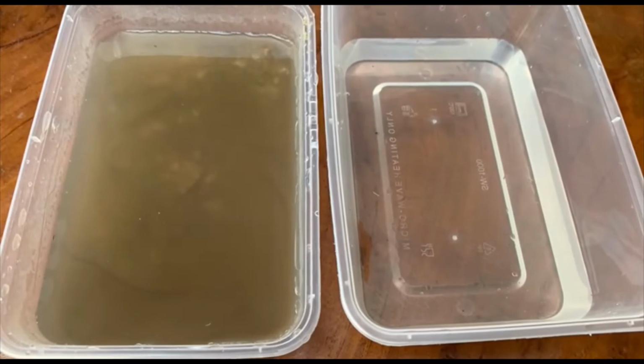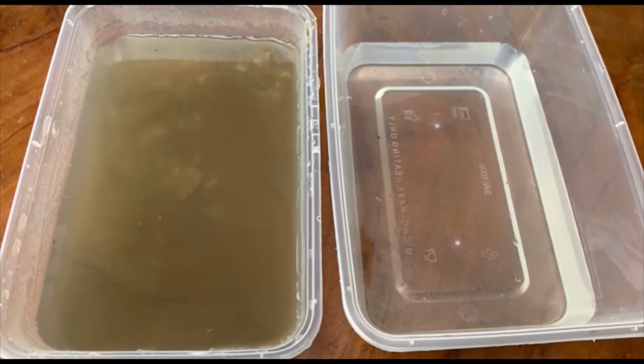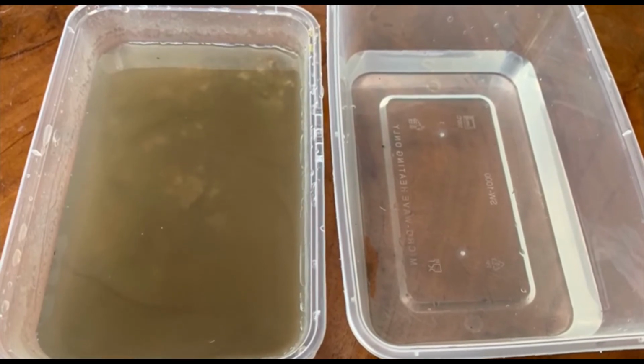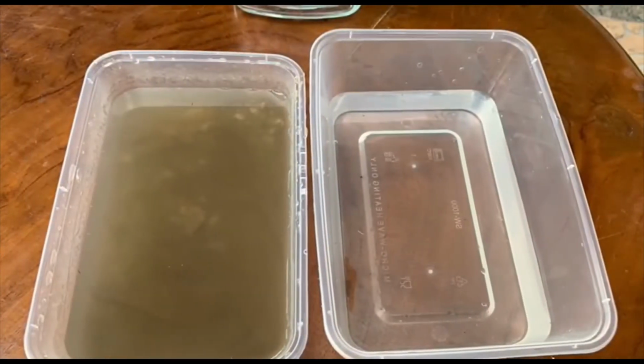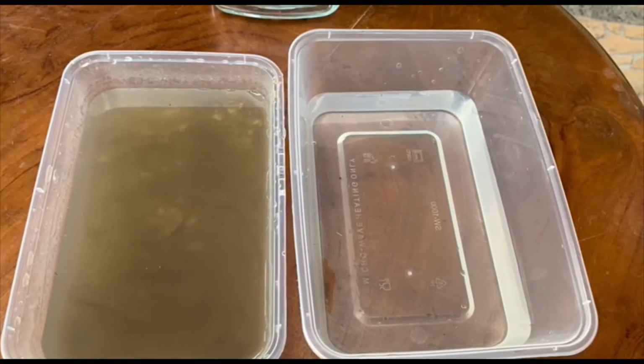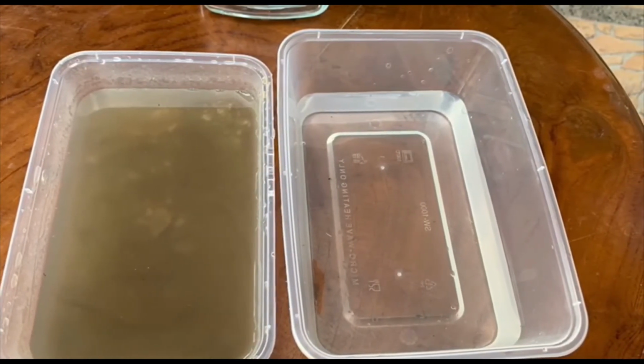Besides, the color of the filtered water is clear while the unfiltered water is quite brownish yellow. Other than that, the odor of the unfiltered water is considered a strong smell while the filtered water has no smell.